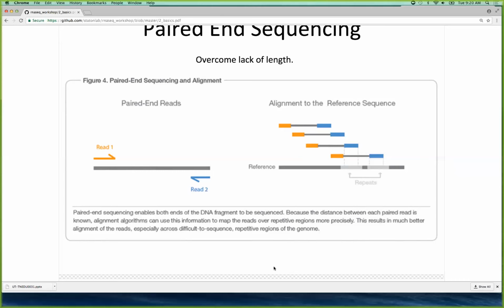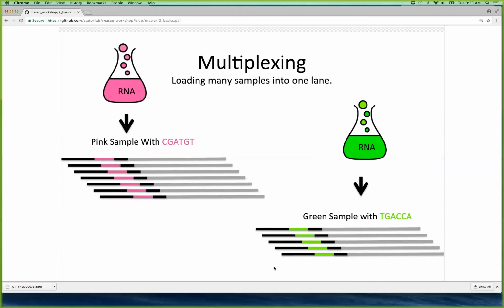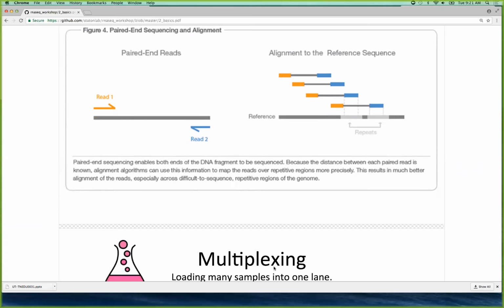But yeah, you're not doing a restriction enzyme or something that would be biased. You are usually doing a mechanical shear, so it's pretty random. Or they have an instrument called the Covaris, which I think does the shearing, can do really high quality, really tight fragments. And that's one of the reasons, right? When you're doing your informatics and you're mapping these back, it's nice to know your fragment length. It's nice to know if these two things should be 50 bases apart, 100 bases apart, or 200 bases apart, because it makes your mapping more accurate. So having that tight fragment is very helpful.